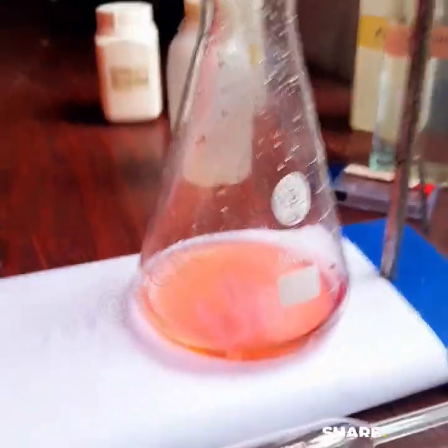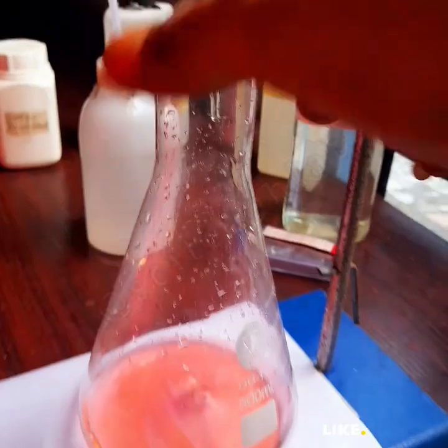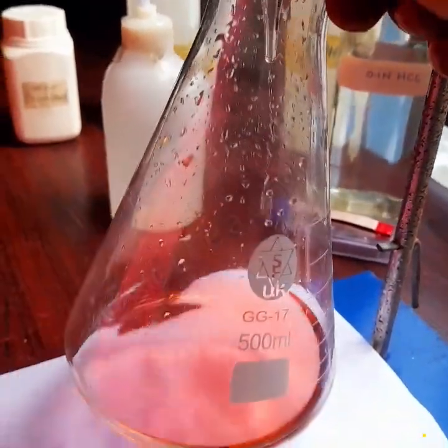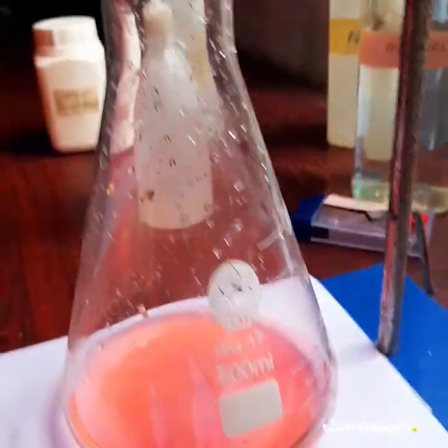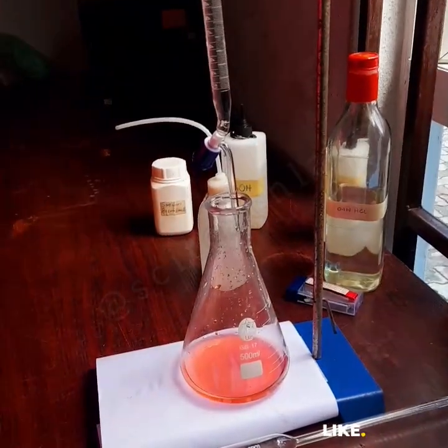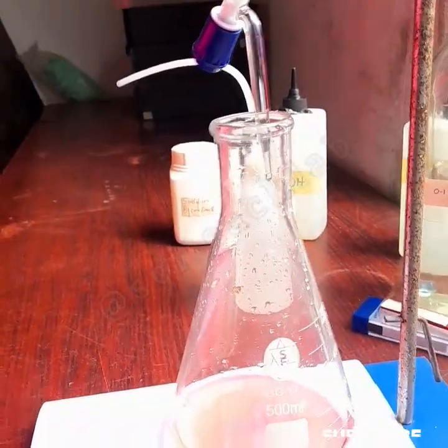Now I left this tap loose. That is what you must not do, because if it keeps dropping in like this, it keeps adding the acid to the supposed neutral solution. So you see, since the tap is loose, it keeps dropping.